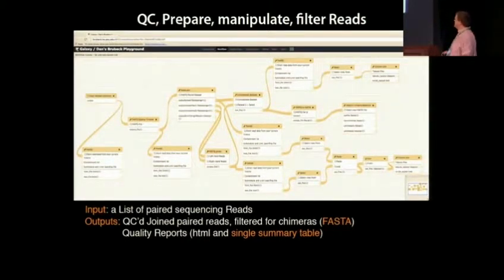We don't want to necessarily lose these reads, so we'll use a second run of a different type of joiner that will actually let us merge our reads together by providing Ns between them. So we basically have the left-hand read, we have a string of Ns, and then we have the right-hand read. And this is perfectly valid to do in Kraken because of the way that Kraken works. It will ignore any k-mers that have Ns in them. And so we're basically trying to have the most specific reads by using the merging join, but then we don't want to lose any reads that are still high quality, but are not able to be merged together.